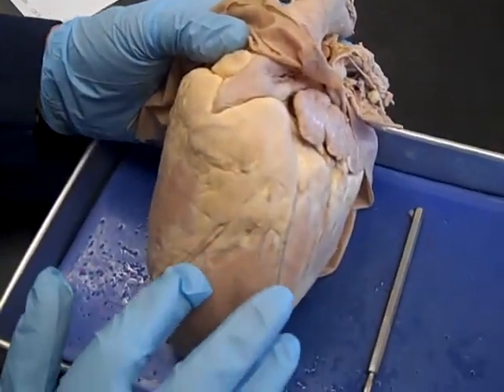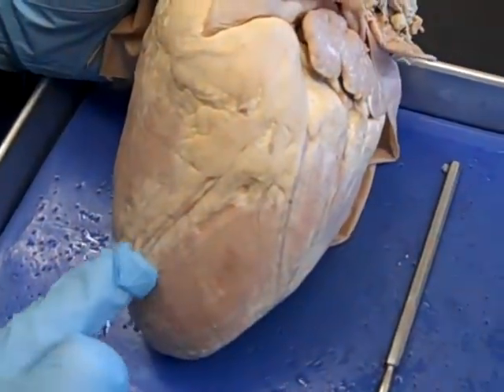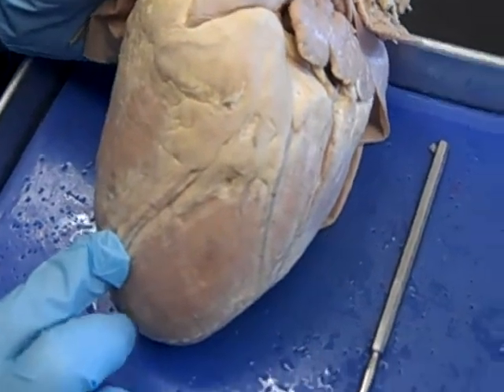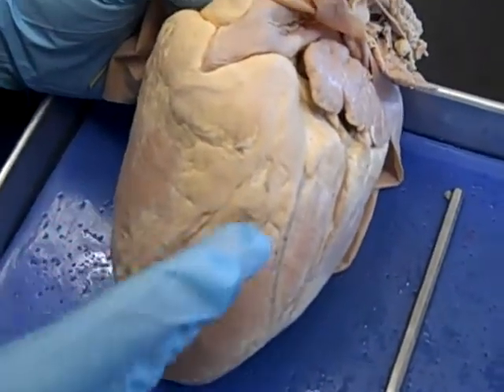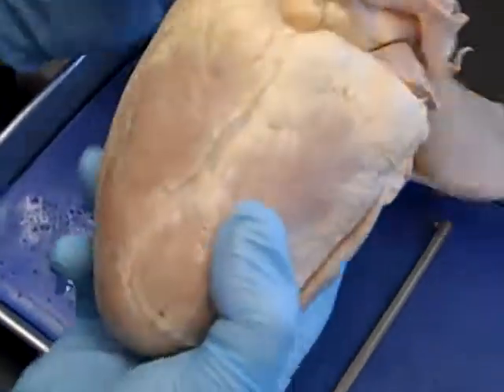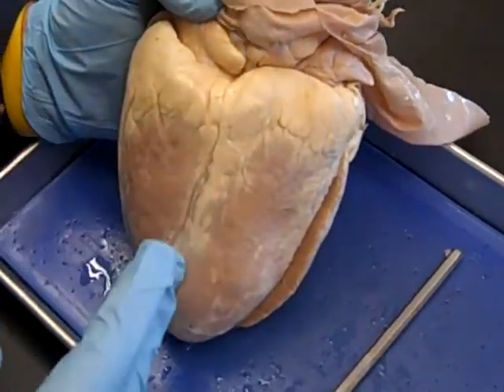One trick I use to tell the ventral side is this interventricular sulcus. 'Inter' means between, so it goes between the ventricles. On the ventral side it runs diagonally or obliquely, whereas on the dorsal side the interventricular sulcus runs pretty much straight cranial to caudal.